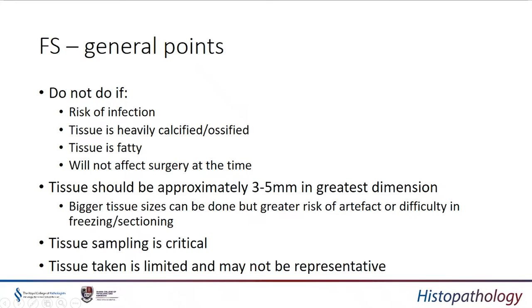The tissue should be of the order of a thumbnail in size and a couple of millimetres in thickness at most. The bigger the size, the greater the chance it won't freeze, won't cut, and the greater the chance of a poor section. Poor sections mean difficulty in diagnosing and potentially a wrong answer. It is critical to get the right area to sample — particularly with large lesions — because if you take the wrong bit you may get the wrong answer.